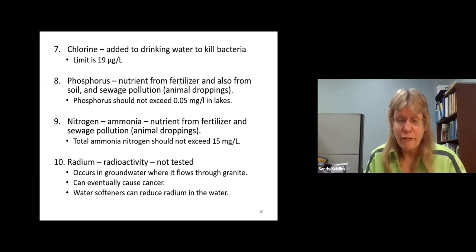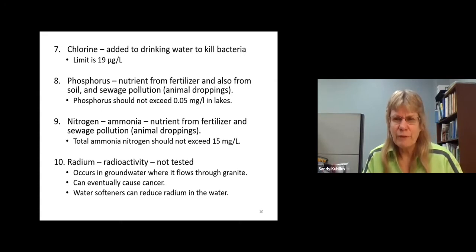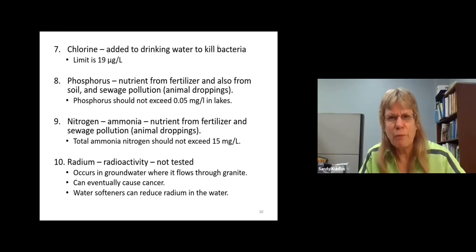Now, we're not going to look at radium, which is radioactivity, which is a concern if you're using groundwater wells, and sometimes you can have radium as a concern. And water softeners can help that. So let me show you a couple of things here.